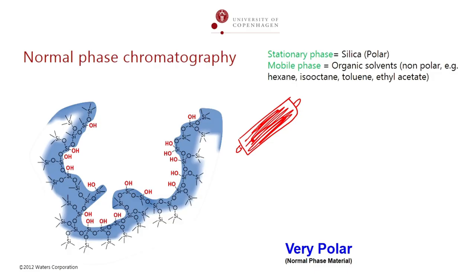It becomes expensive, so it is filled with silica. This is the structure of that particular column powder. You can see that one. How does it look?